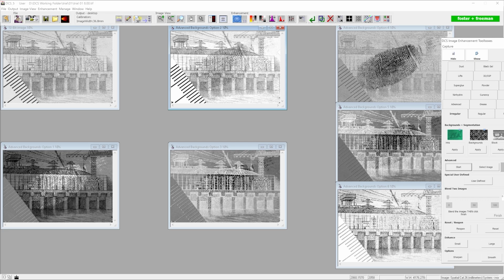Now, with the background, we're going to try and remove that background. And because the background is dark, the way that we can do this is to look for another background from the other images here that is the opposite. So if we look for a background that is white in colour, that's the opposite to black, when we blend them together in the software, they'll cancel each other out, which means that they'll disappear.